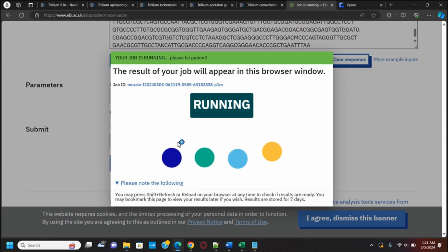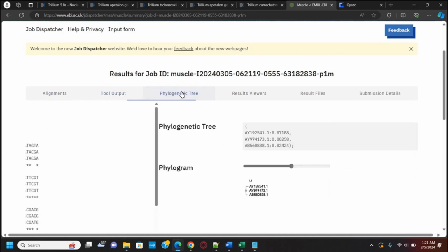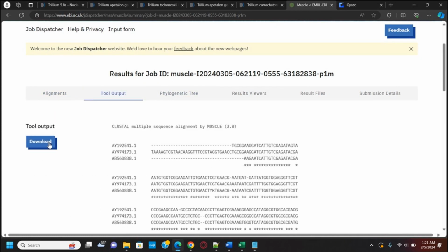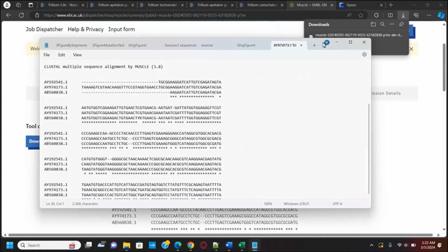Cool. Time is precious, so I'm going to pause it here. Okay, that's at like 10 seconds, I think. Cool. Put it from here. You can copy from here. Just copy right there.